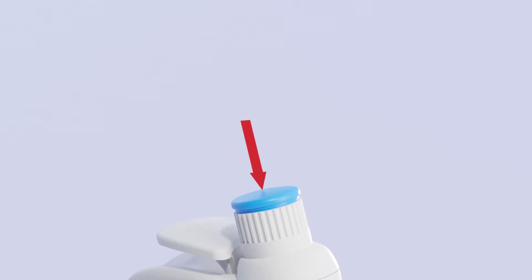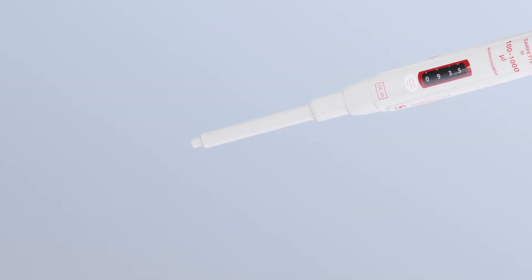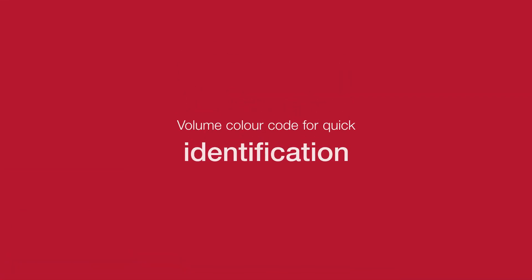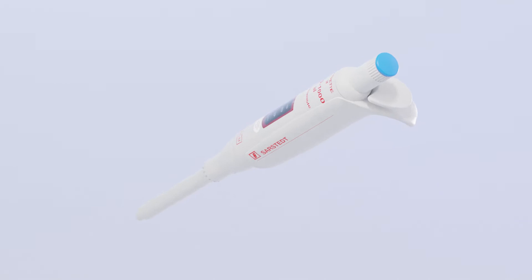The smooth pipette button and large ejection button are designed to provide particularly ergonomic work processes. Use the adjustment button to attain the correct volume. Clear click stops and a rotatable thumb rest prevent the Zarpetta from moving. The push button colour coding enables direct and intuitive assignment to Saarstedt pipette tips.